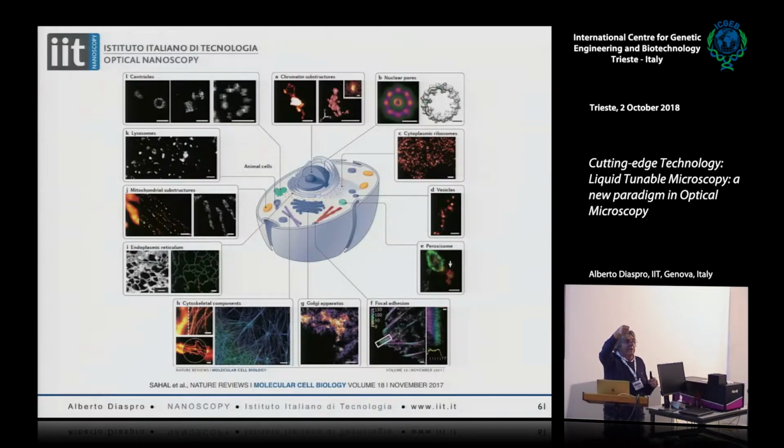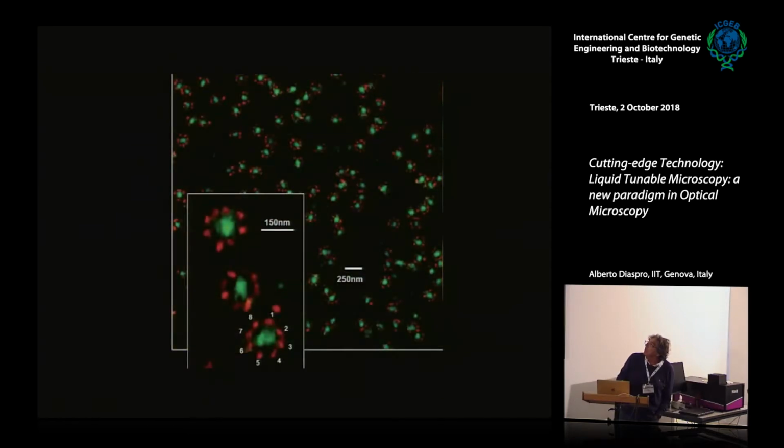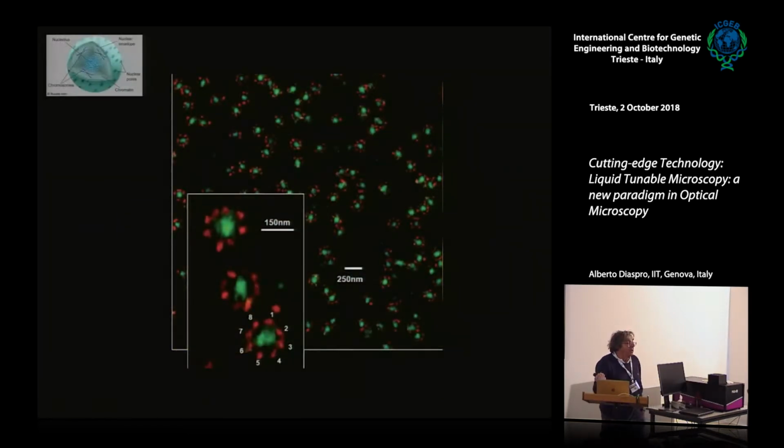And my suggestion is the following. Before starting to play this game, please define which is the resolution you need. It's not a washing machine. It's not that you put your sample inside, then you turn the knob to any program. You have in mind something specific. And for example, I would not be able to recognize which kind of part of my sample this is, but now if I turn my knob increasing resolution, maybe you can better recognize that these are nuclear pores on the surface of the nucleus. And so really you can play a game that is very interesting.